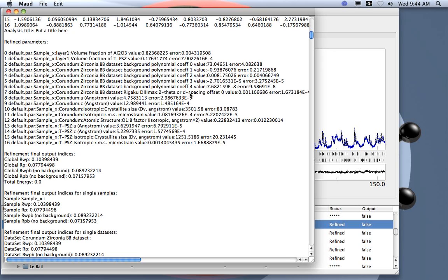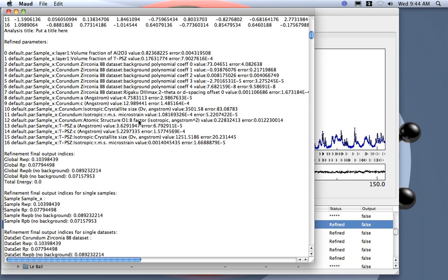A background parameter, a 2-theta displacement or offset, the cell parameters for the corundum, crystallite size and microstrain for the corundum, and a B-factor. Actually, the program for quantitative analysis uses by default only one overall B-factor, so all the B-factors were equal to the first one, the one of the first atom of the first phase.